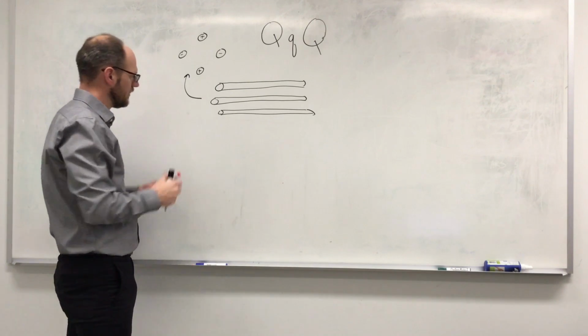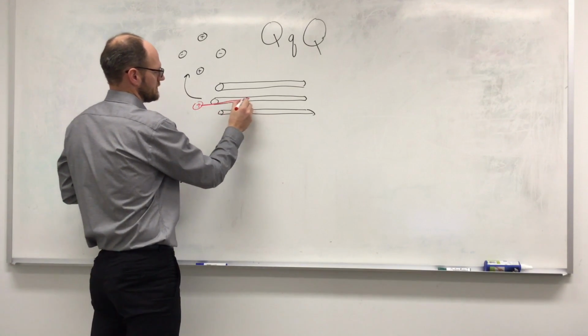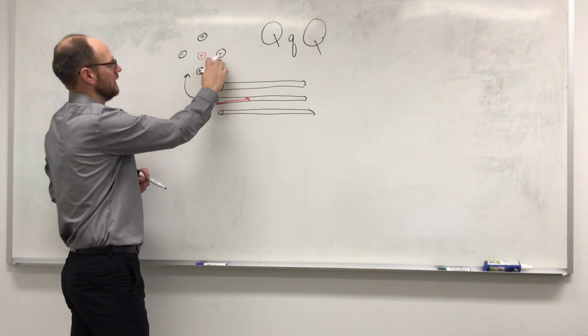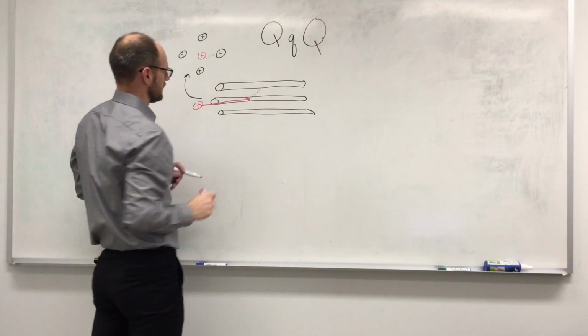And at some time 0, you have a charged particle, an ion, flying into this rod. And when it does, it's attracted to the opposite charged rod. So it starts to fly towards this rod. It starts to bend away towards this rod here, for example.